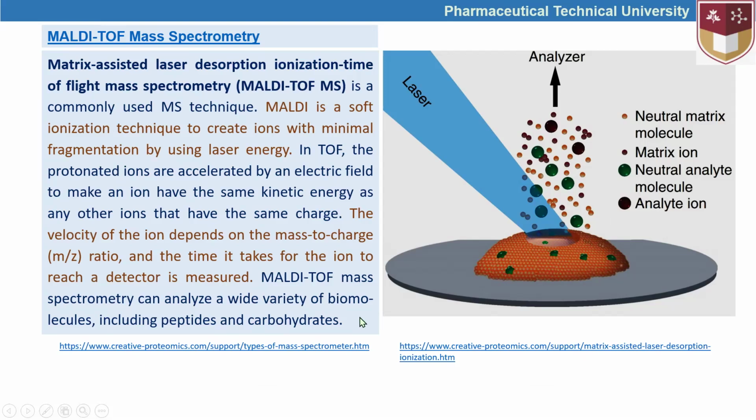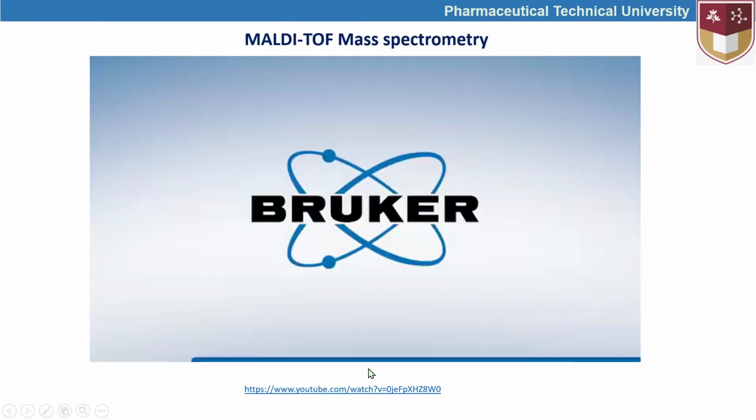MALDI-TOF is a mass spectrometer that can analyze a wide variety of biomolecules, including peptides and carbohydrates. In this video lesson, now we can see the working mechanism of the MALDI-TOF.